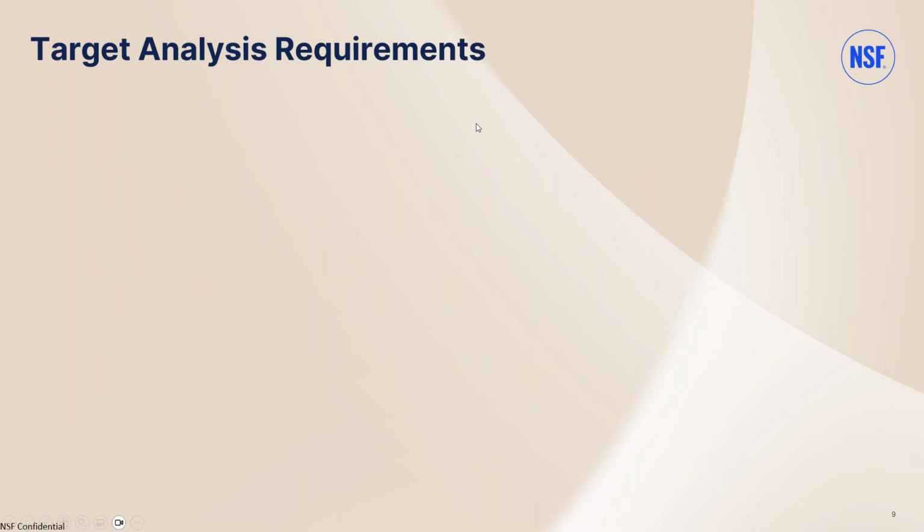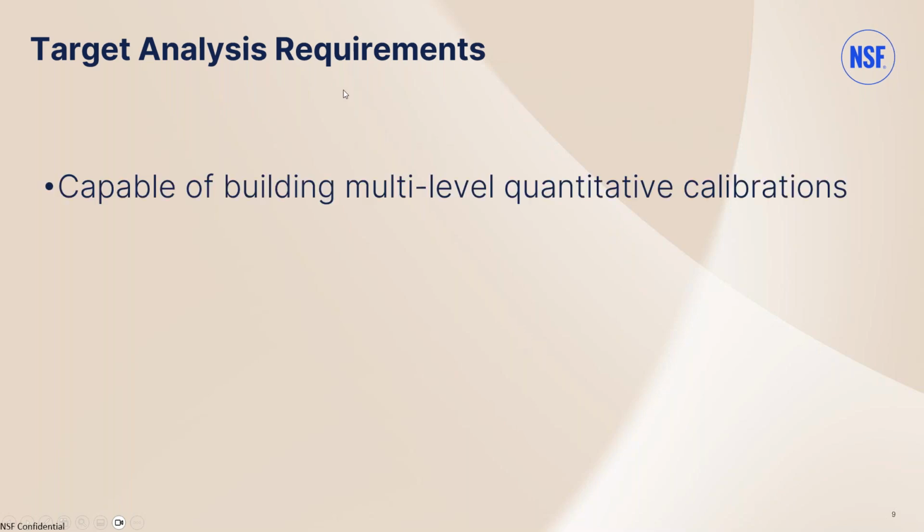At the same time, we started thinking that it might be a good idea to standardize our target analysis across labs. So we started looking for a chromatography data system that could work across our labs just as well. We had some requirements for that as well.